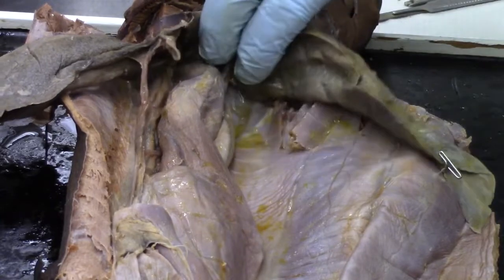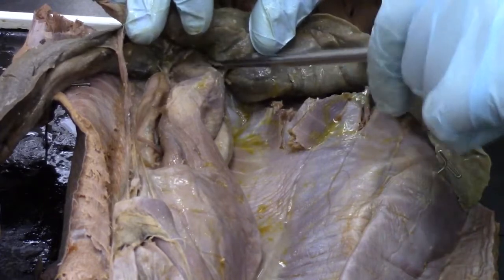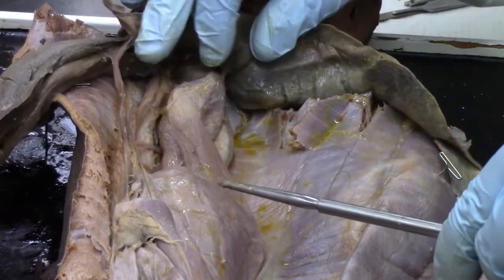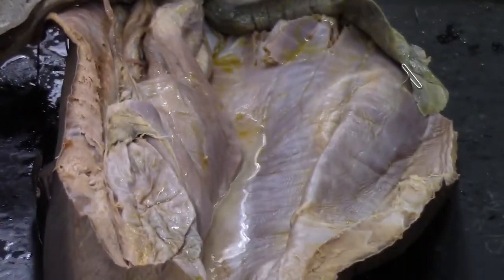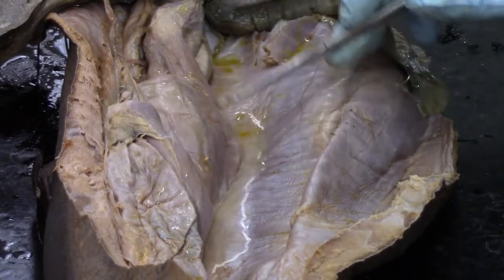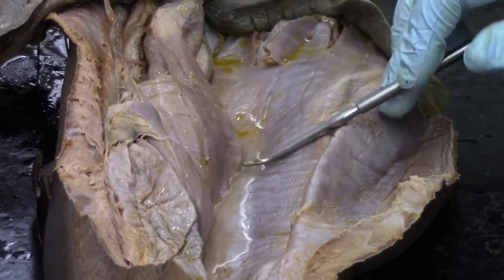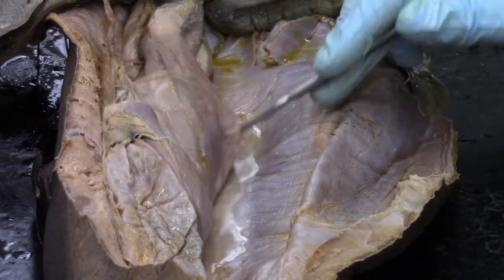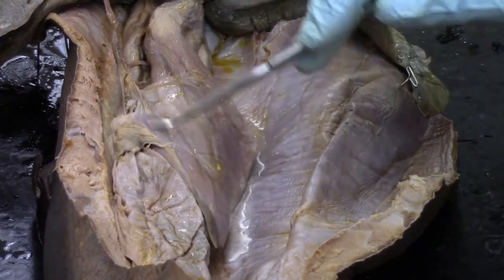If we lift the liver towards the head a little bit, we can see a little bit of the esophagus. And the esophagus continues down here to the stomach. Now this shark has a particularly large stomach. It would have just had a meal fairly recently before being sacrificed. So it's not usually this large. Usually it's more smooth and just shaped like a kind of a J.